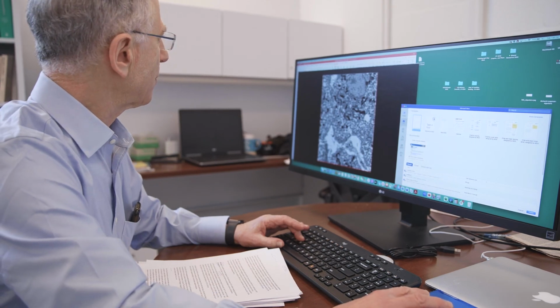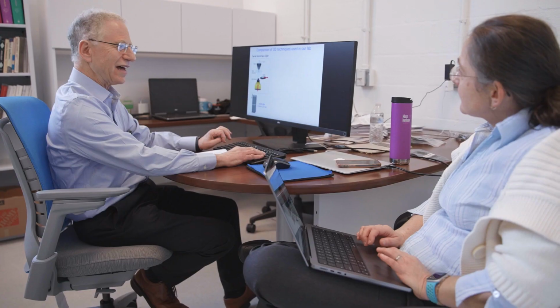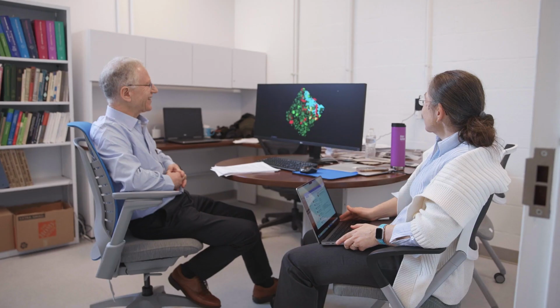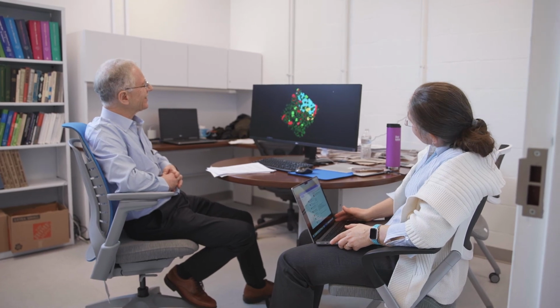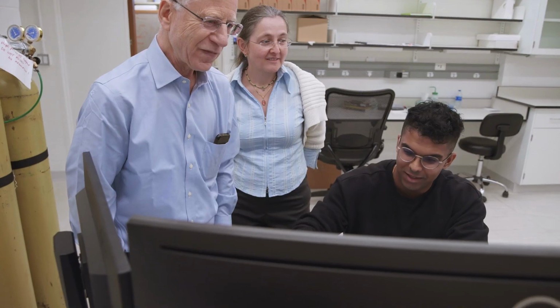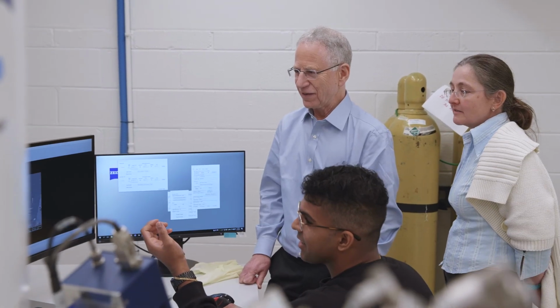One project that we are beginning to work on is to look at the architecture and organization of liver, which is a complicated tissue in terms of the blood vessels and how nutrients are taken from the blood, stored in the liver, and then come back out again. The future is trying to develop the best resolution we can get, but also the idea to combine techniques together to obtain information that was not previously possible to obtain.